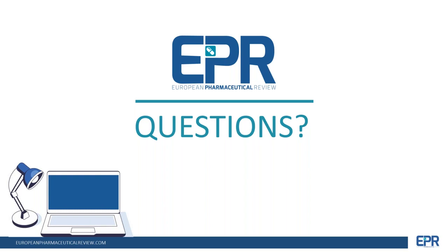Okay, good. We have somebody asking a question regarding the RSD percent. For RMT, the RSD percent was 1.4. However, what about the RSD percent for the uncorrected area for the peak of interest obtained? Can you provide more information? Sure. The data provided was actually uncorrected. It wasn't relative migration time. It was uncorrected migration time. So the 1.4% number is uncorrected migration time RSD, not relative. And also, Adi, the peak area data that you showed was also just raw peak areas that were measured. There was no correction there. That is correct.